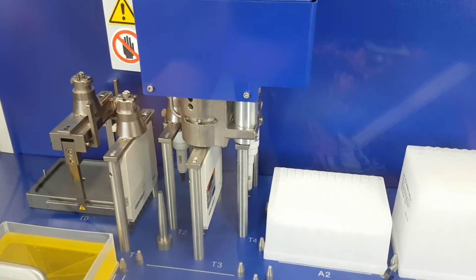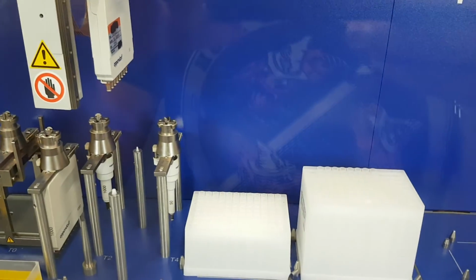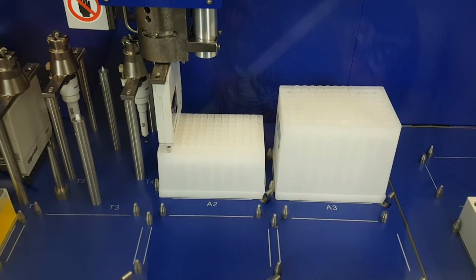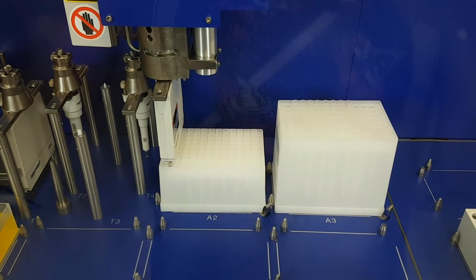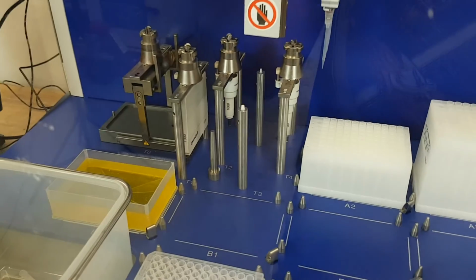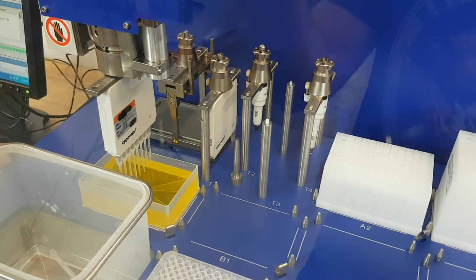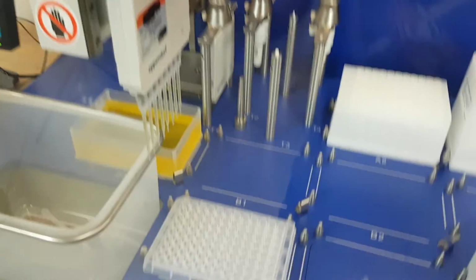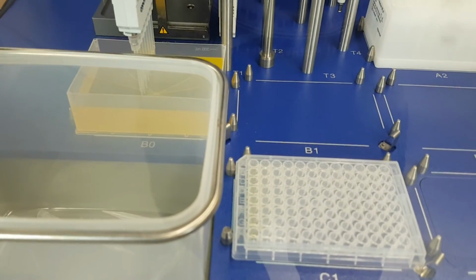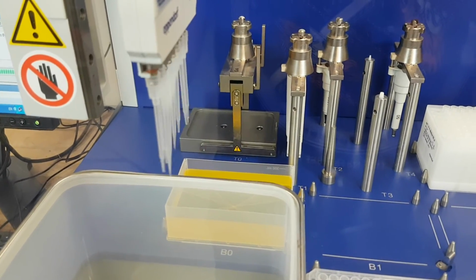You can see it locking into place slowly. So here we do have a full plate of pipette tips. So it's just going to grab that first row. So it has taken 50 microliters of yellow water and dispensed them. And it's emptying the pipette tips and tossing them in the trash.